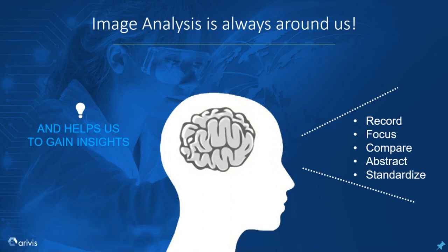So you may want to study some object in your image. Maybe one day you don't have an idea about what this is or how you could analyze it, but maybe on another day you do. And software gives you the ability to hold on to it, come back to it another day. It also gives you a way to easily compare mathematically, algorithmically, these different kinds of objects that you see in the image.